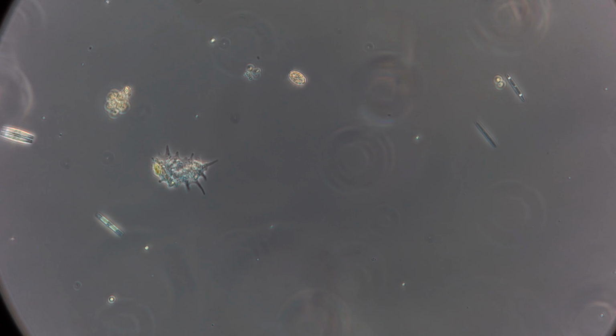I think it did die. Oh wait, I think I see its flagella. No, maybe it did die. Damn. I see things die a lot. It's such an interesting thing. It's so small. It's present and now it's not.